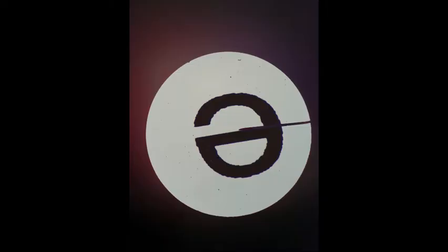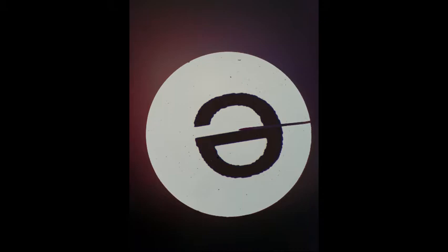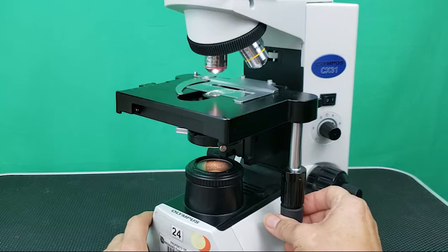Center the letter E over the opening in the stage and turn on the illuminator. Look through the ocular and observe the circle of light that is called a field of view. Make sure the 4x scanning objective is in place over the stage opening. It will click in position.